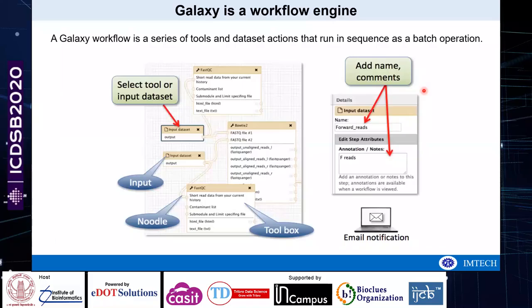So here is the workflow engine of Galaxy. If you have performed some task in Galaxy and generated some history, from this history you can also make your workflow from scratch. Here is a depiction of these types of workflows which you can also generate from the history.